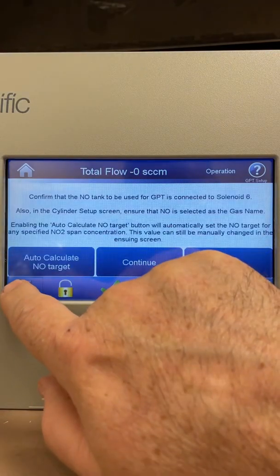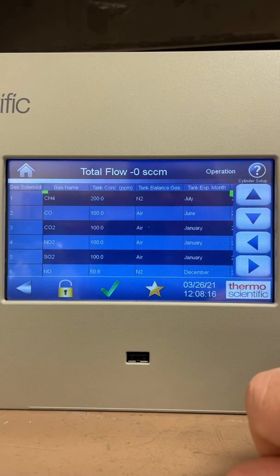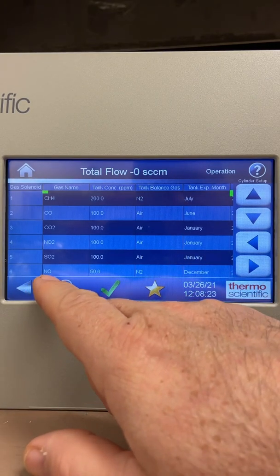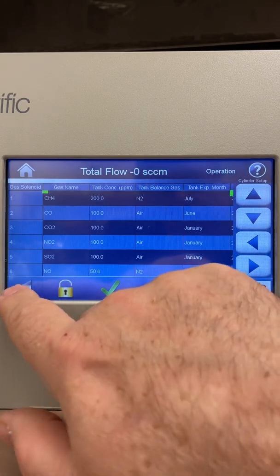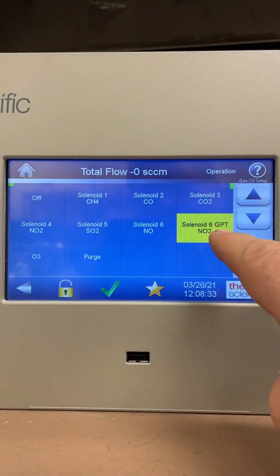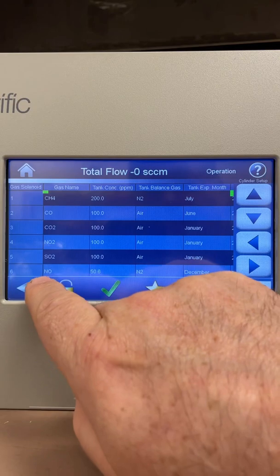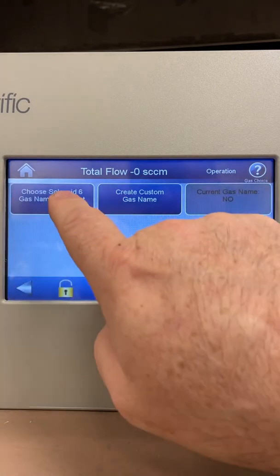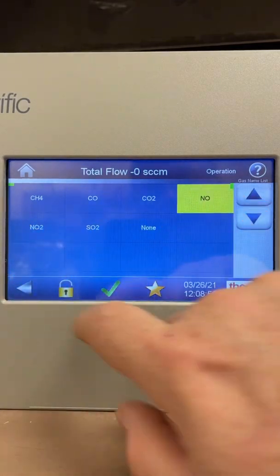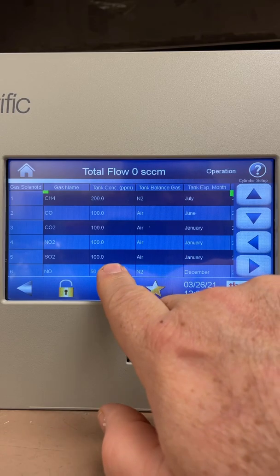Going back, there's a cylinder setup screen which is important to complete before you begin. For GPT, you put your NO cylinder onto solenoid 6 — because if you remember, solenoid 6 is GPT NO2. Go into cylinder setup, and make sure you've got your NO selected; you can choose it from the list — there's NO, CO2, NO2. Select NO, then enter your cylinder concentration — in my case it's 50.6 ppm — on the keypad.